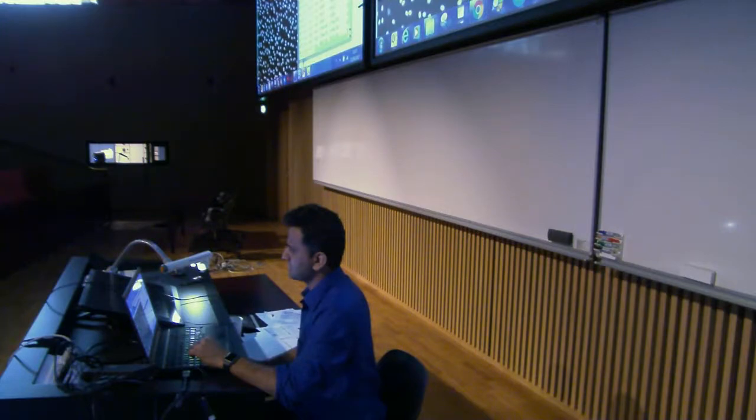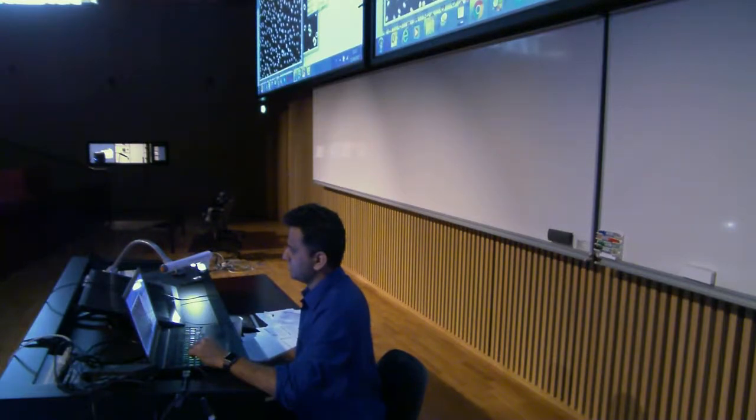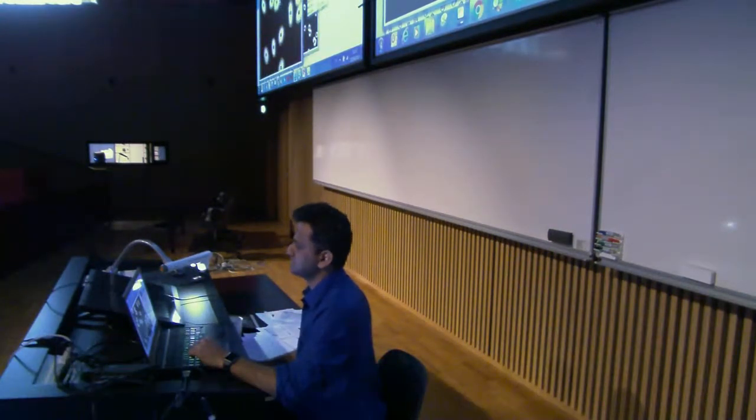Okay. Is everything clear now? How to make an overlay? So just say show. Now you can see here on the raw data itself. This is my raw data. And this is the outline of the segmented nuclei. Okay, and it's going to give me the numbers also.